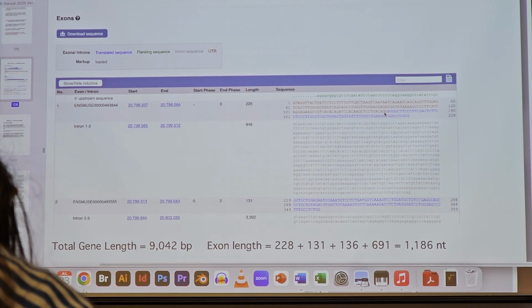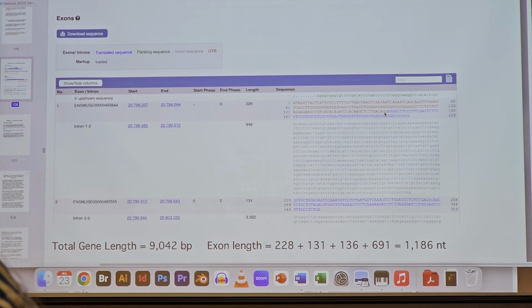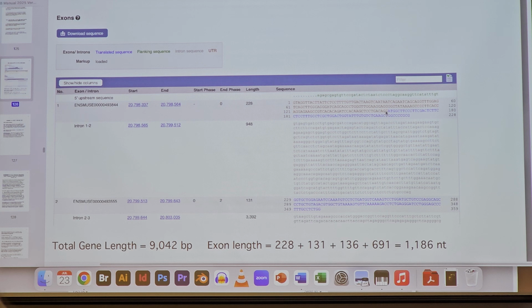Now the way sequencing works is the very first nucleotides that come off the sequence you can't actually read because it's too messy, the fragments are too small, the matrix doesn't resolve it well. So you're not going to read right off the end of the sequence. So the end of the primer is G. We're not going to pick up the sequence at this first G. It just doesn't happen. It's going to happen about 10 nucleotides down. Okay? Because the first few fragments that you make are too small for the matrix to resolve. Okay. So we're going to start the sequence a little further down, but we're still going to be in exon 1.